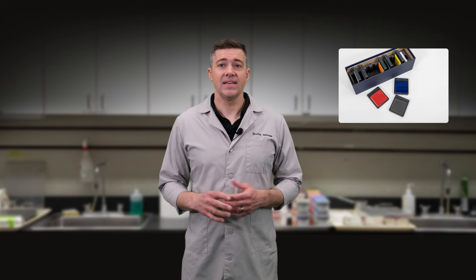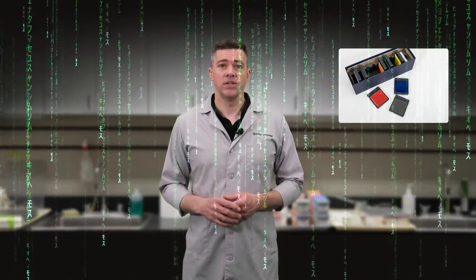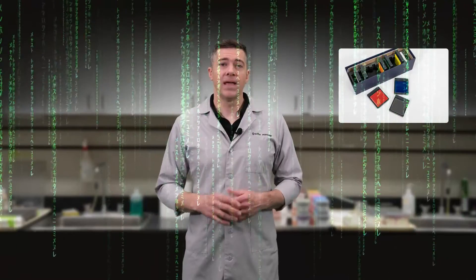Net profiling your instrument monthly helps to compensate for drift caused by these conditions, as well as contamination and internal changes to the instrument. Net Profiler utilizes a serialized set of standards tied to X-Rite Centroid values that form a profile — sort of like a digital correction that can be applied to your instrument to improve its performance at your facility across the color spectrum, not just the Centroid. For customers with multiple locations, Net Profiler ensures alignment for their entire fleet for consistent measurements. This is especially important if you're operating in different environmental conditions.